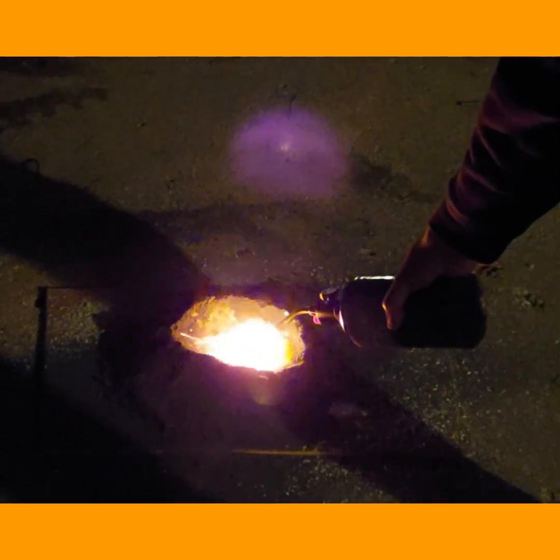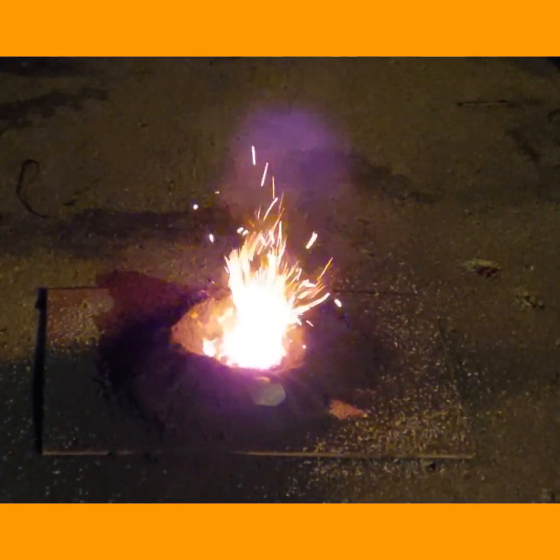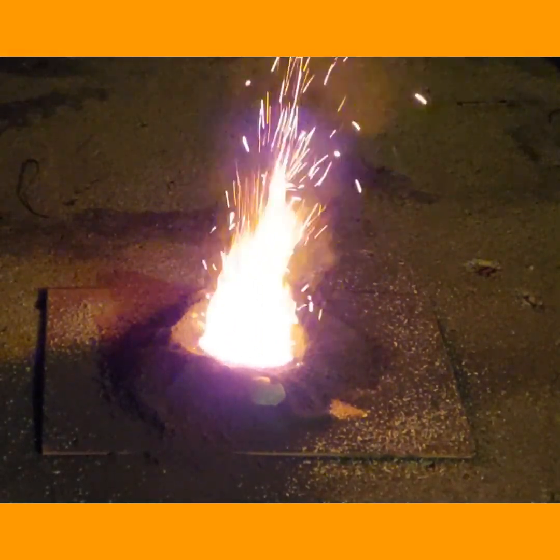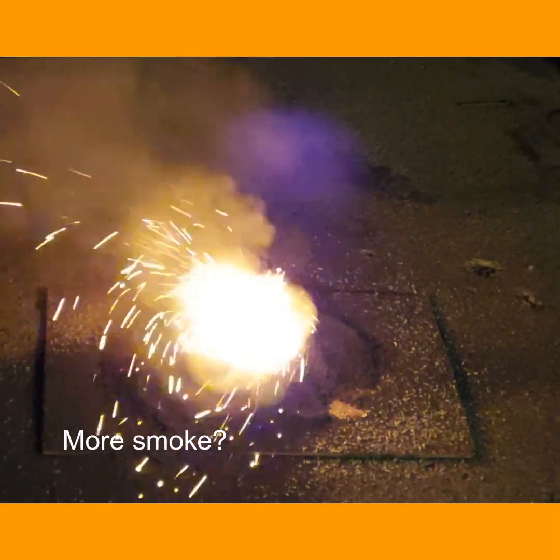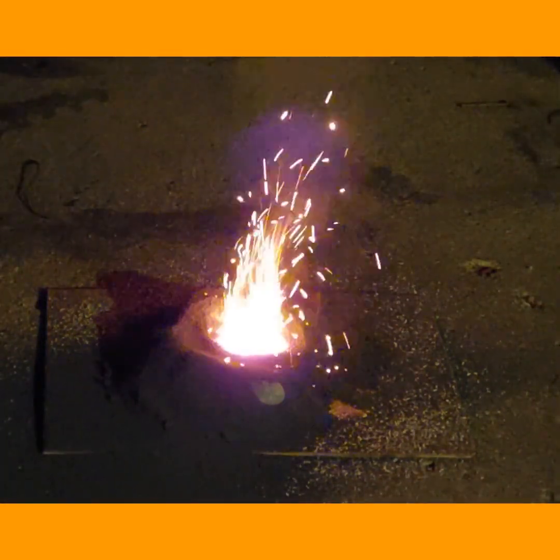Lighting the last mix. Kind of looks like a volcano there.